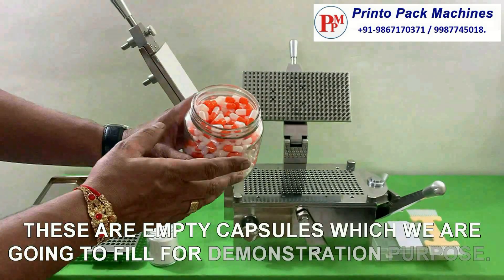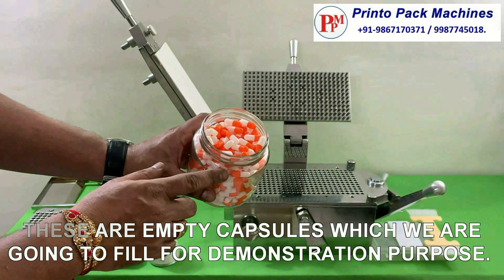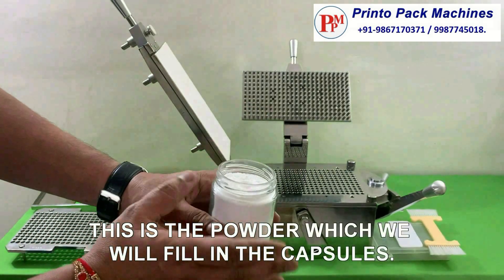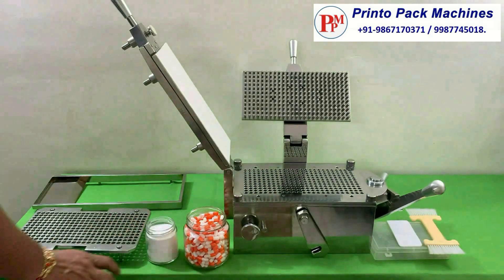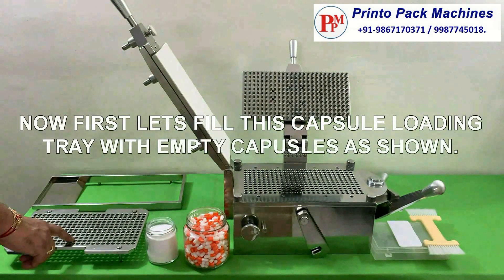These are empty capsules which we are going to fill for demonstration purpose. This is the powder which we will fill in the capsules. Now first let's fill this capsule loading tray with empty capsules as shown.